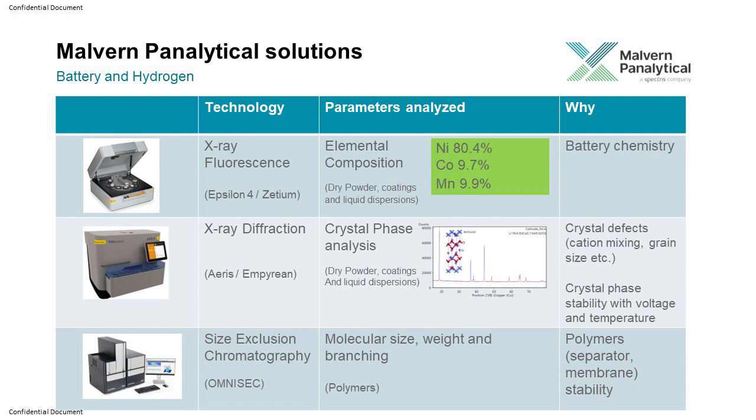Then we have the X-ray fluorescence. X-ray fluorescence is a technique that measures the elemental composition, so whatever is your chemistry. X-ray diffraction is the crystal phase analysis. I will come to these two techniques in more detail.